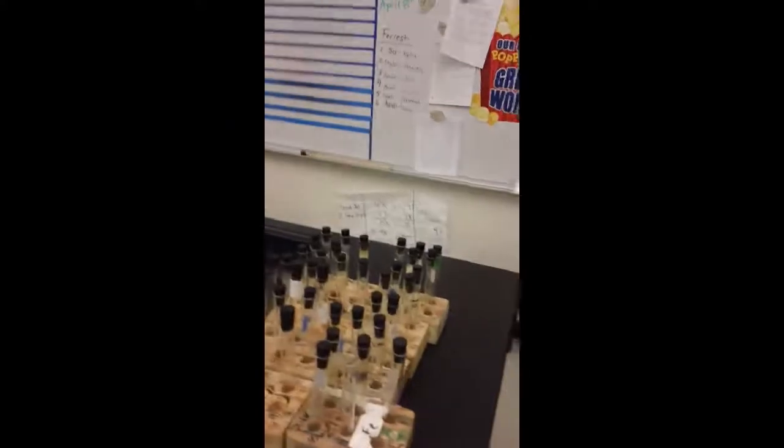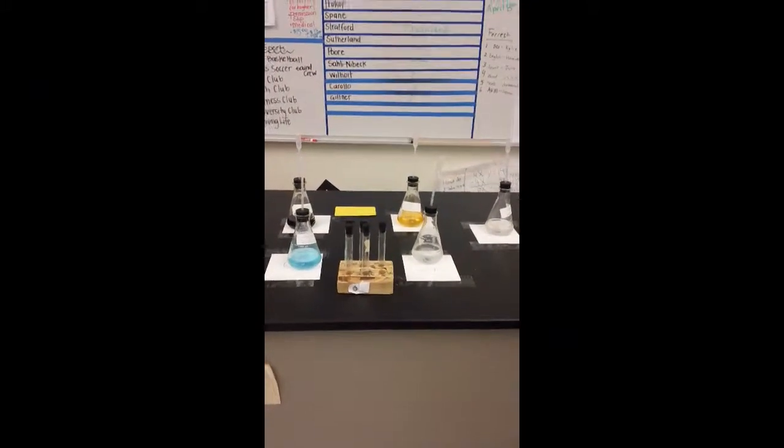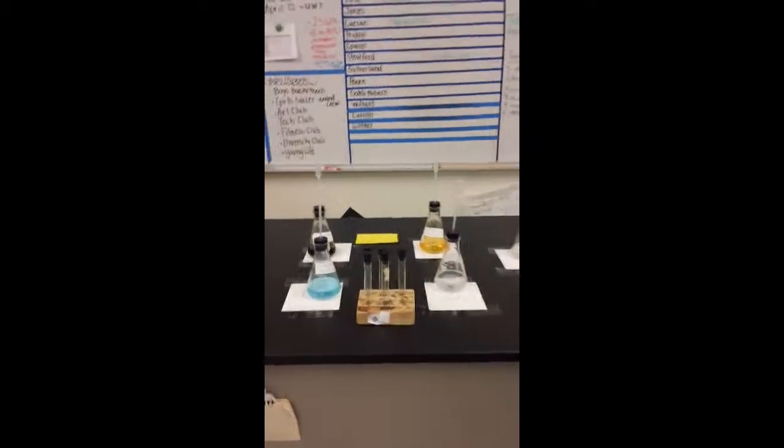Students came here, they got one wooden block full of 5 test tubes. Notice how they all have stoppers. And then what we did is we came over here and we had 5 different known solutions. So for example, we know that this one over here is Cr, which is chromium, and it's a chromium nitrate.